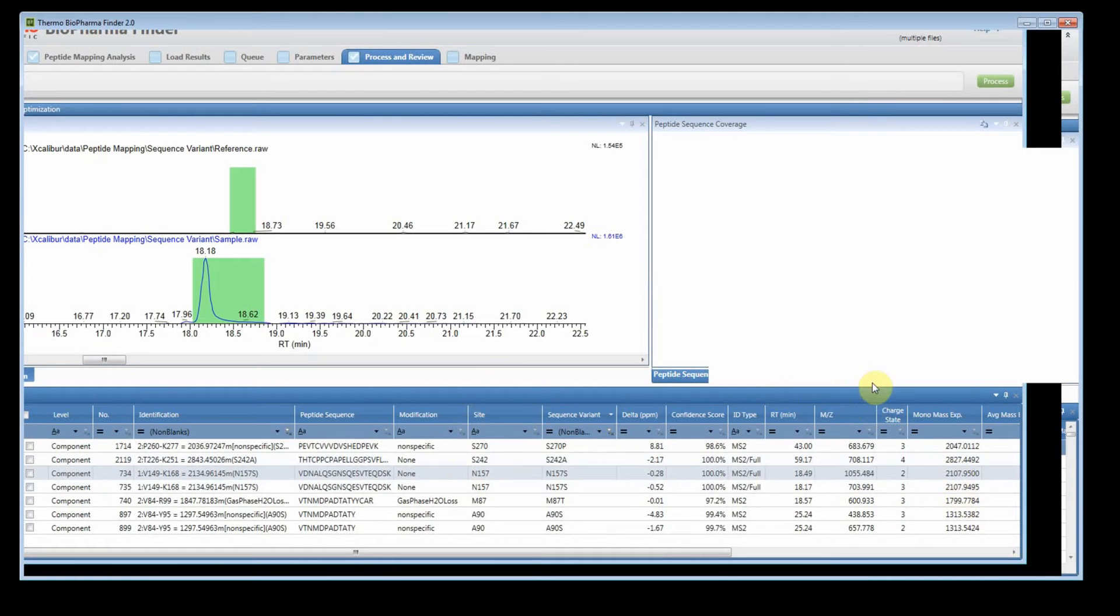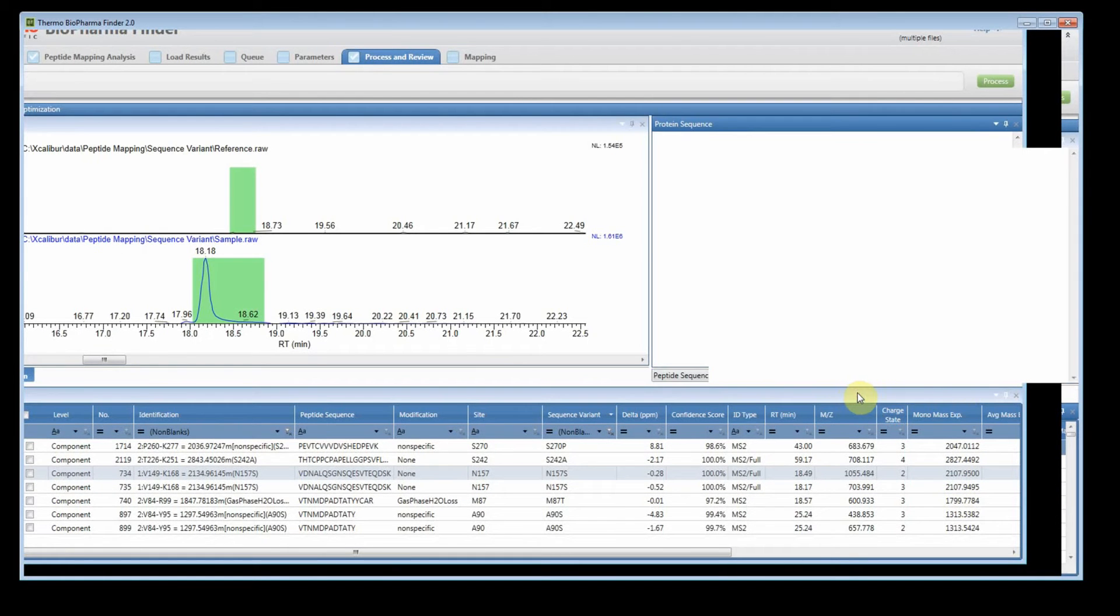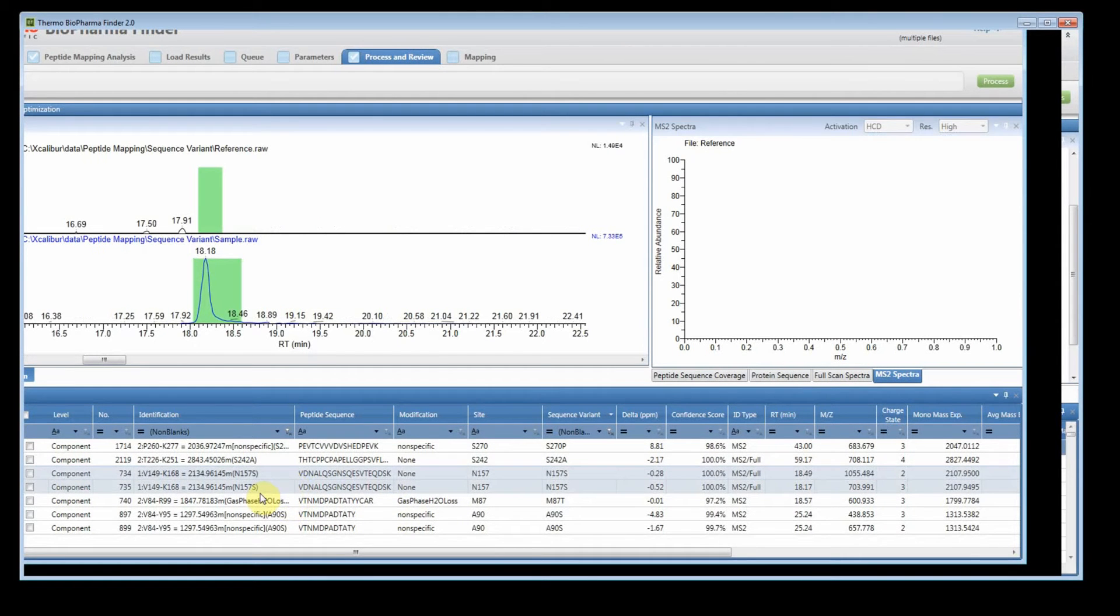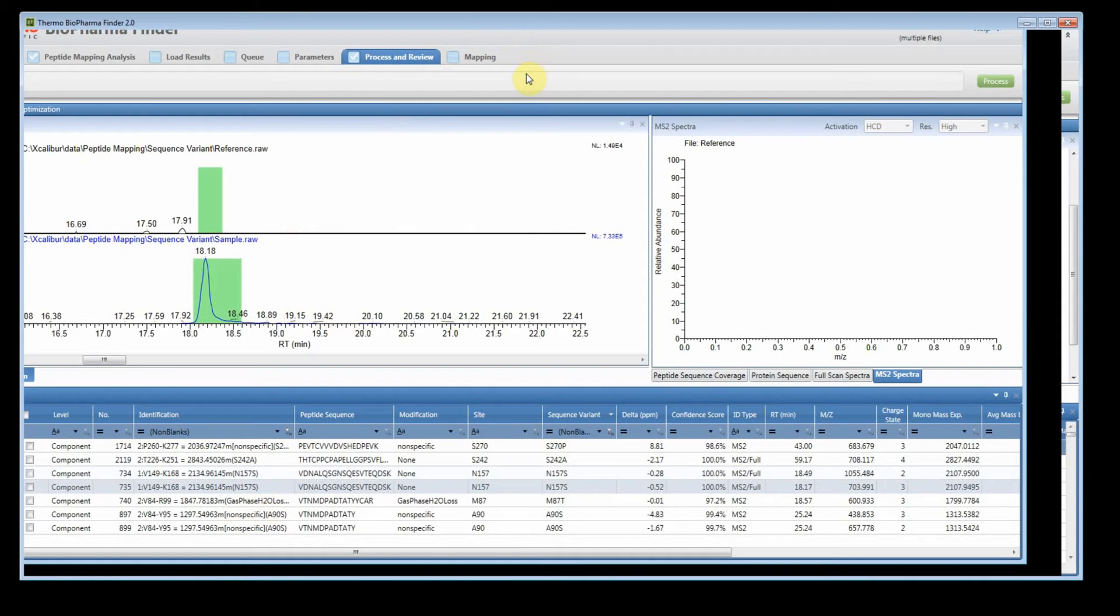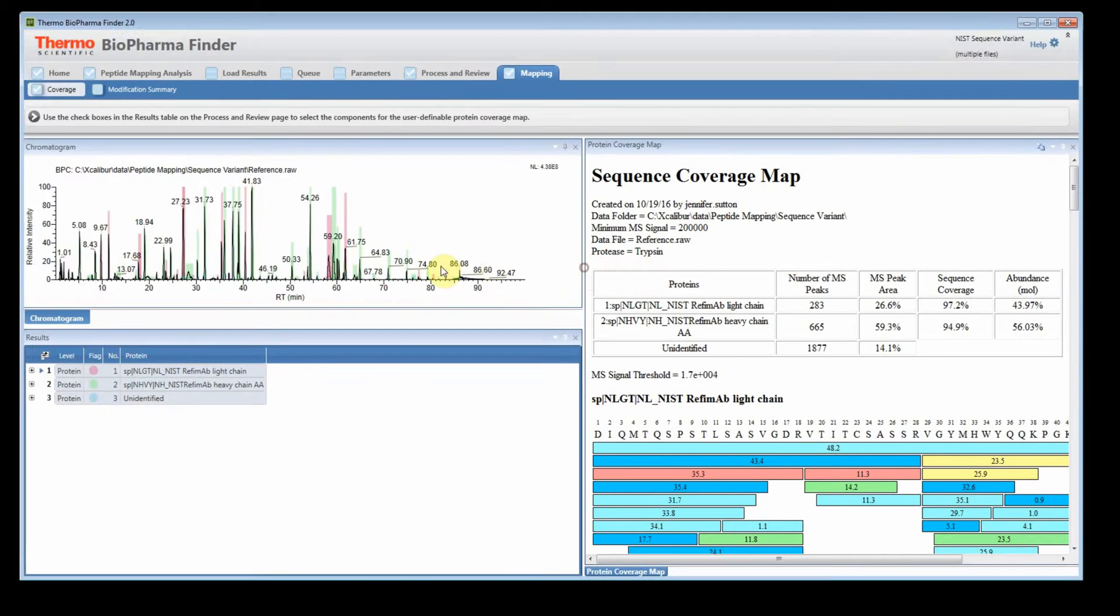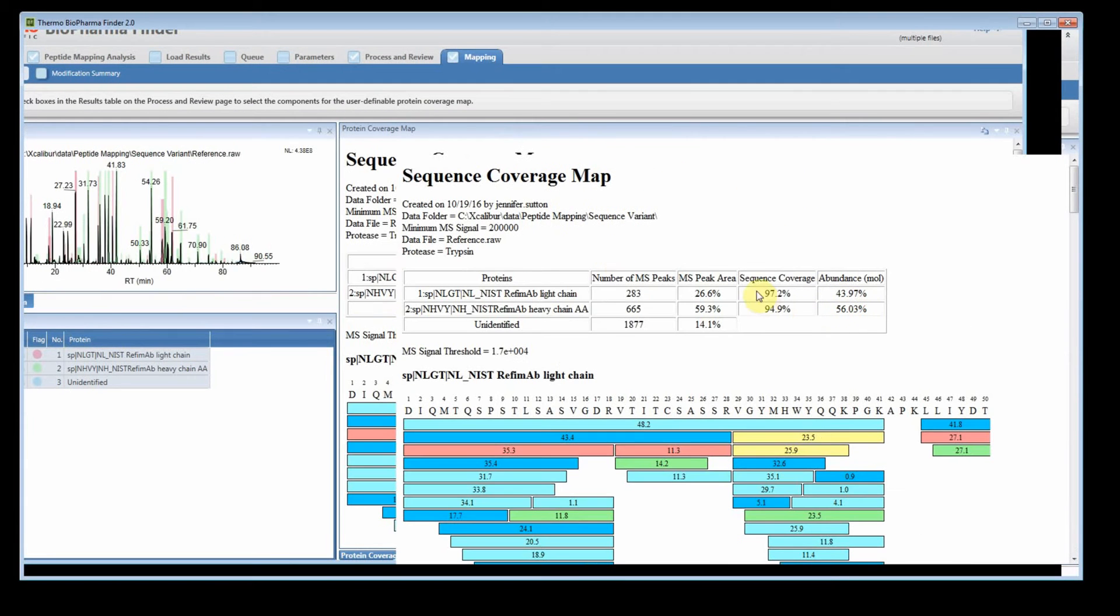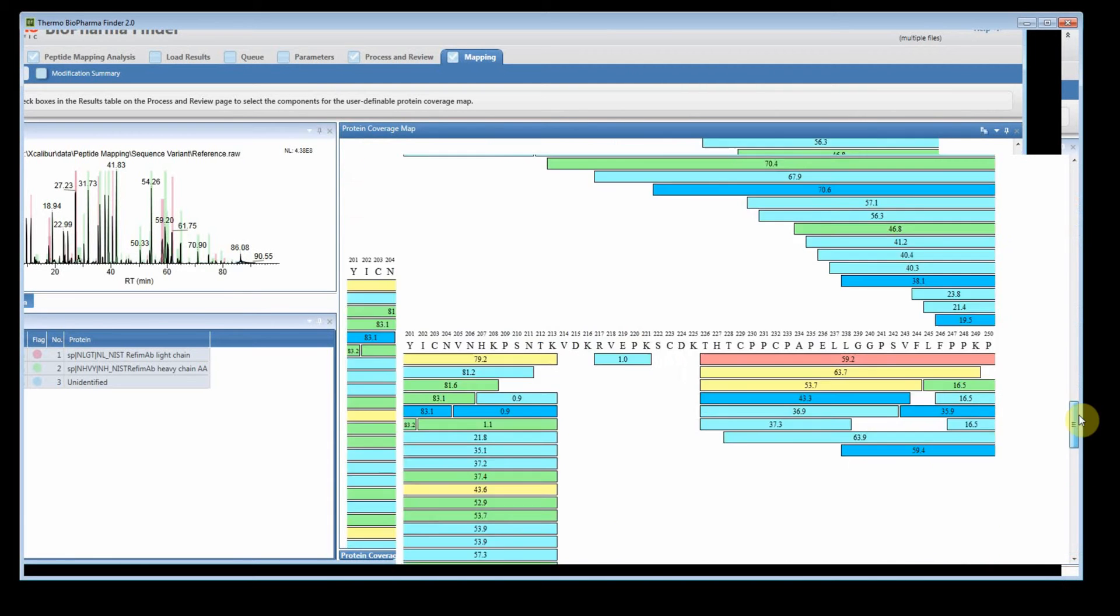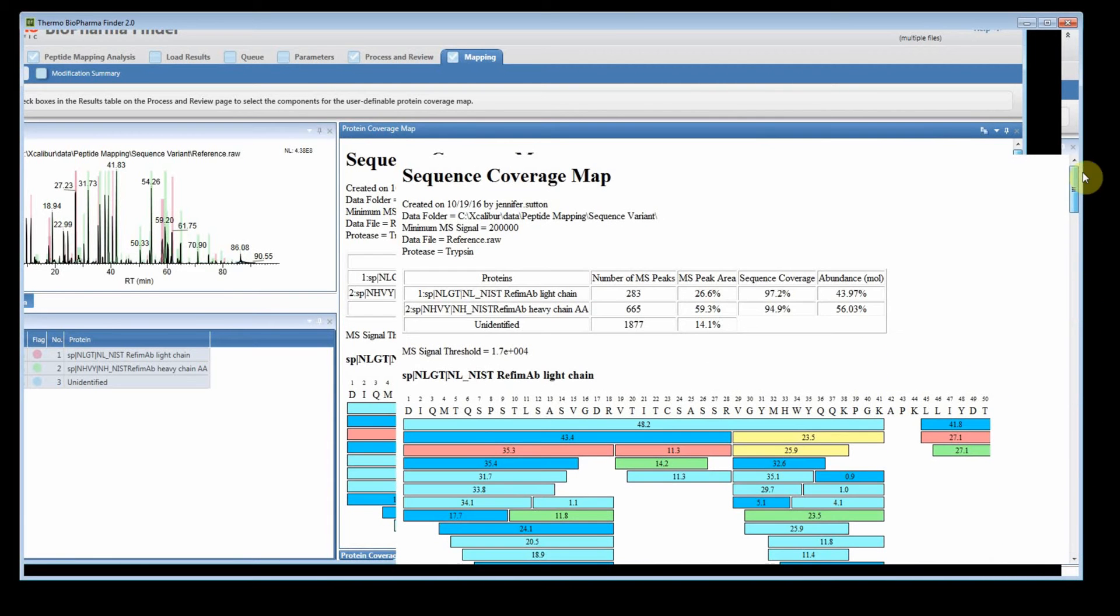So what I want to demonstrate for you is that one of the new features that we have in BioPharma Finder 2.0 is the ability to control the coverage map. So if we go to the mapping tab, you'll see the normal peptide sequence coverage map and we have quite good coverage just with the default settings. And you can scroll down and you can see all the pretty colors to show the peptides.